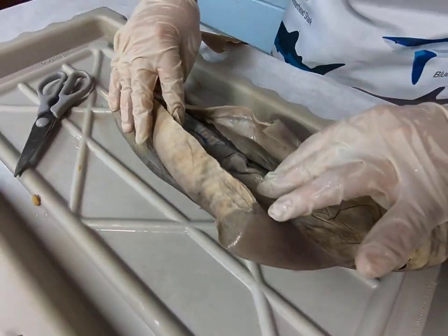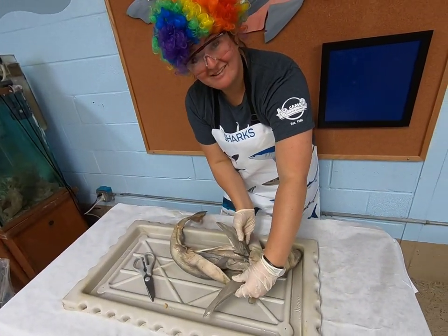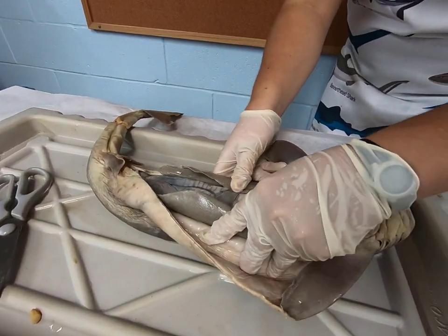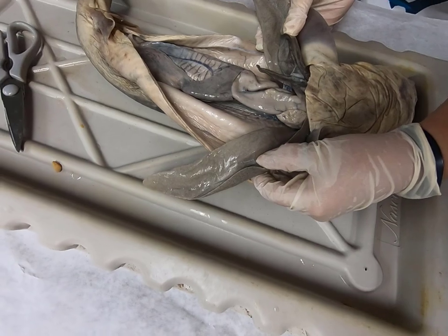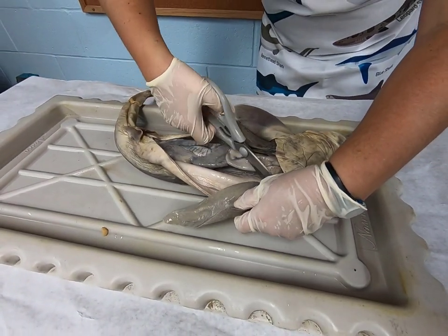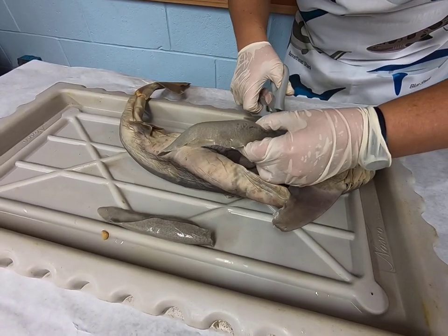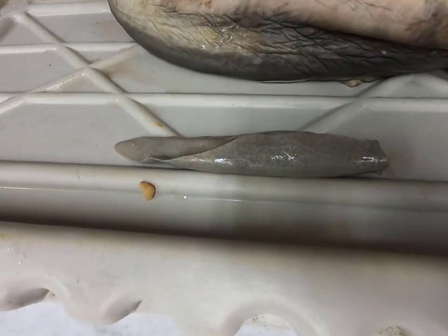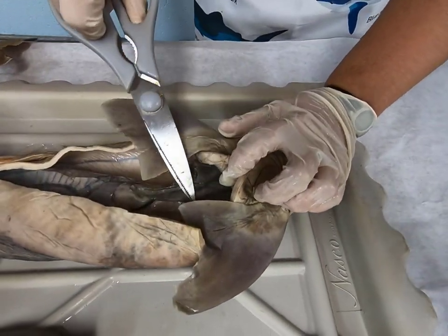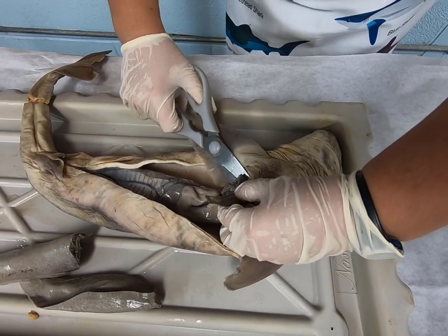So sharks, the largest organ in their body is actually their liver. So if you look at the shark, 33% of their body is actually the liver. Now, the liver, I'm going to cut it out a little bit, has three different lobes to it. We have our right and left lobe of the liver. And then we have our middle lobe right here. And our middle lobe, I'm going to cut that out as well, has the gallbladder attached.